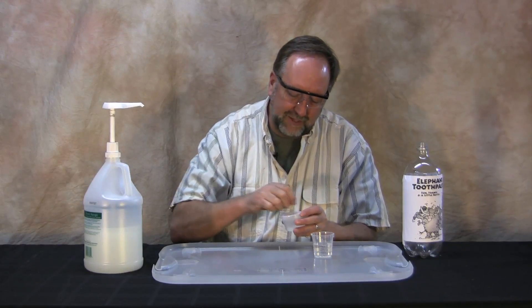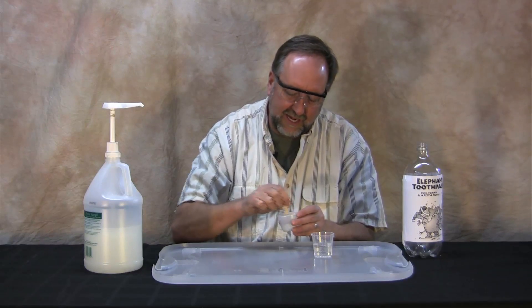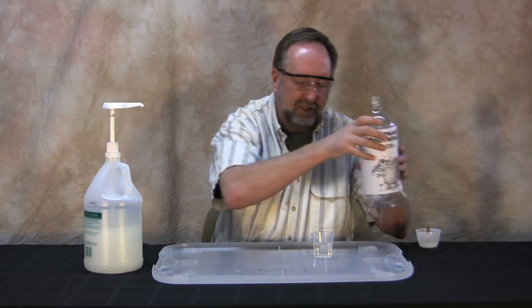Now, what's going to happen is there is a natural process that goes on all the time with hydrogen peroxide — it decomposes into water and oxygen.